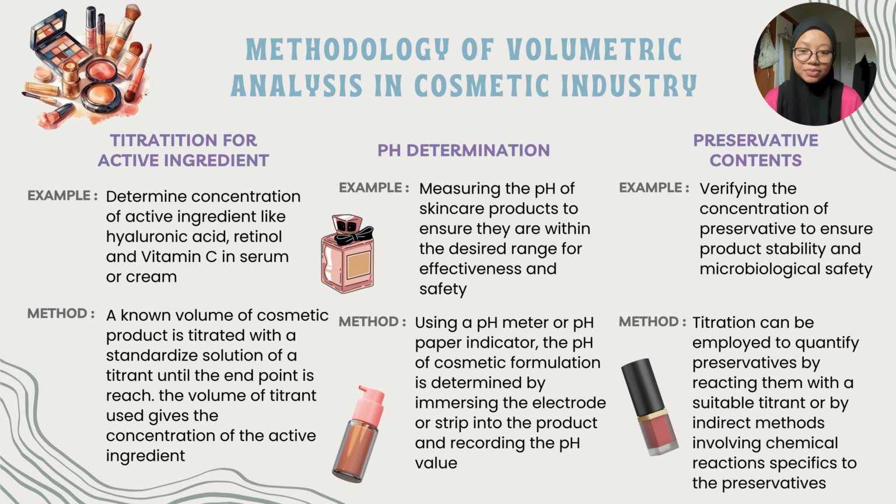The last one is preservative contents. For example, verifying the concentration of preservative to ensure product stability and microbiological safety. So, the method is titration can be employed to quantify preservative by reacting them with a suitable titrant or by indirect method involving chemical reaction specific to the preservative.